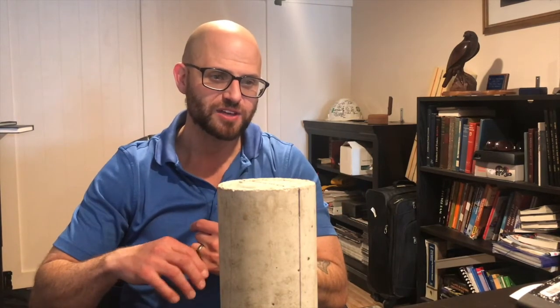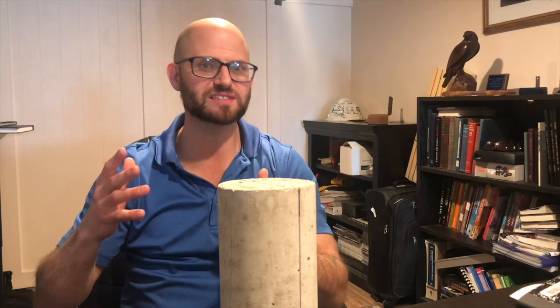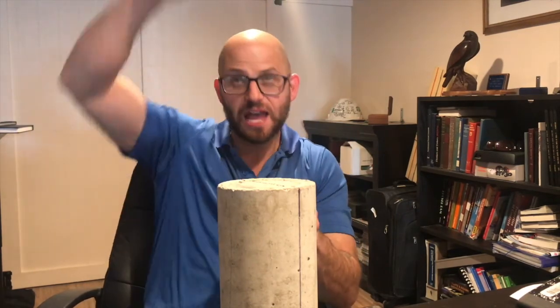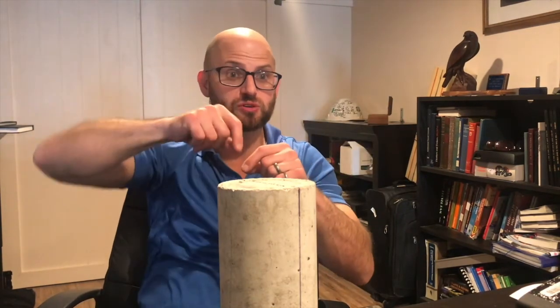And before we get into it, I think a definition of what scanning electron microscopy is warranted. And I've got a photo here that we took. It looks like a really pretty mountain range, some really nice high detail. And we took this photo in a JEOL. It was a pretty old JEOL, I think a 1996 scanning electron microscope. In a scanning electron microscope, we'll take a really, really small sample and bombard it with a bunch of electrons.